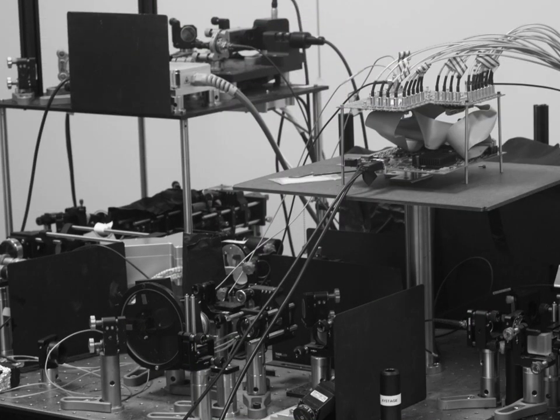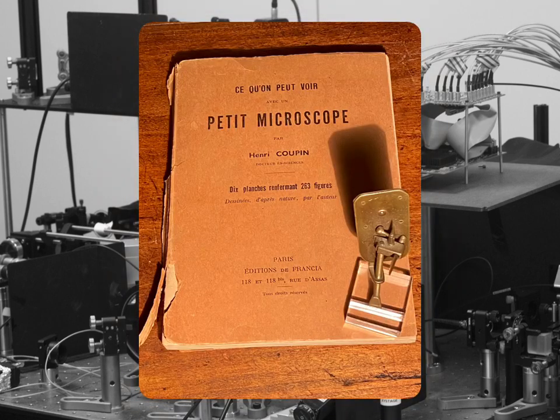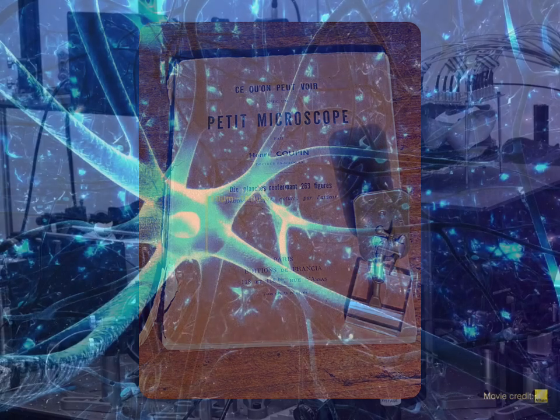But now, the main point is that in order to take advantage of this possibility, you have in some way to build your instrument, or to have a very good commercial instrument, why not? When you build your instruments, you have so many new technical advances, but what you really need are the basic concepts. This is the Van Leeuwenhoek microscope: you have a rounded piece of glass, inserted in a stable material, like in this case a metal, and you can have light passing through and you can see better details. Better details of what? Of the world that you want to investigate. In our case, the biological cell.